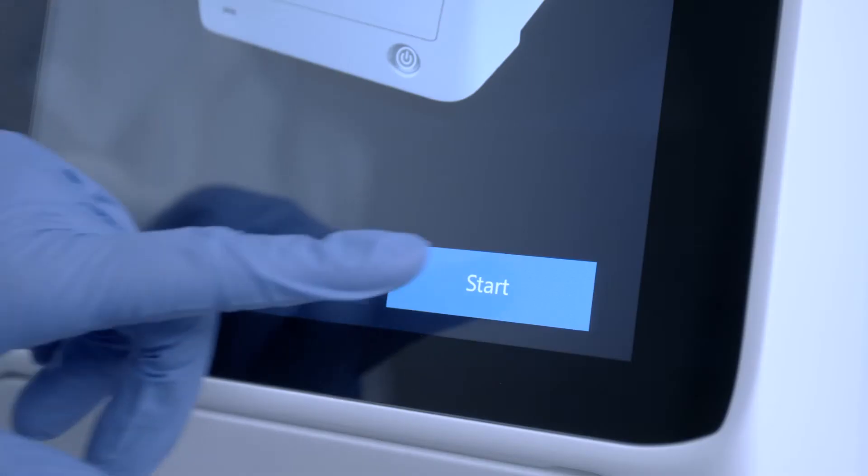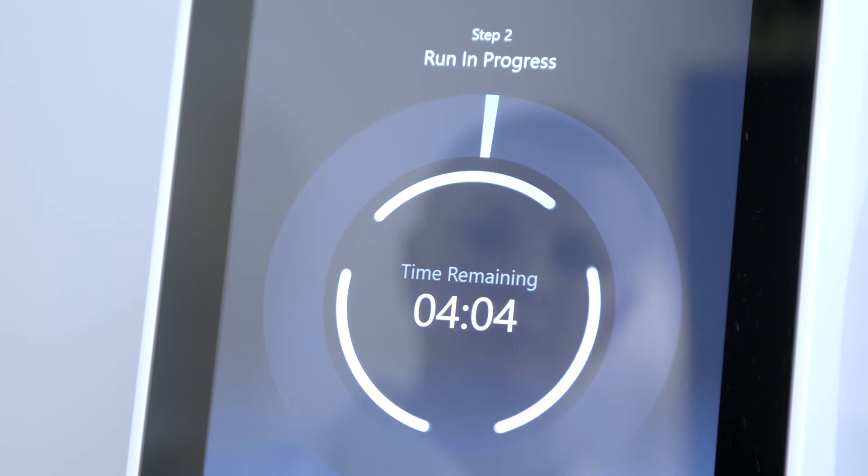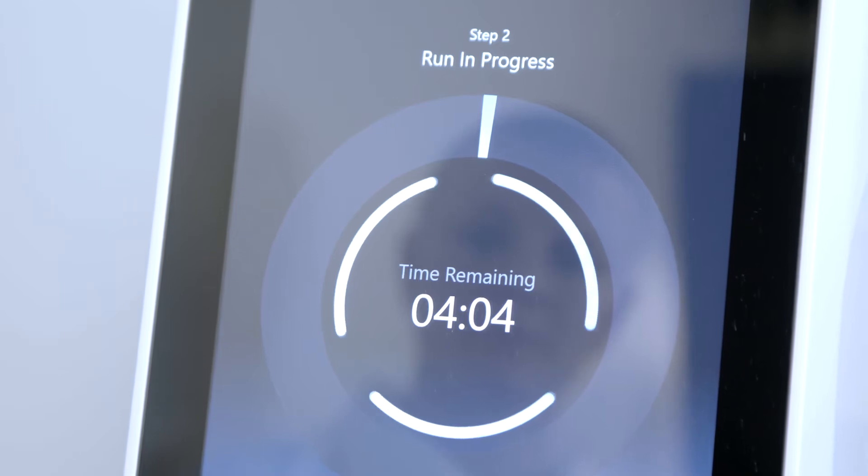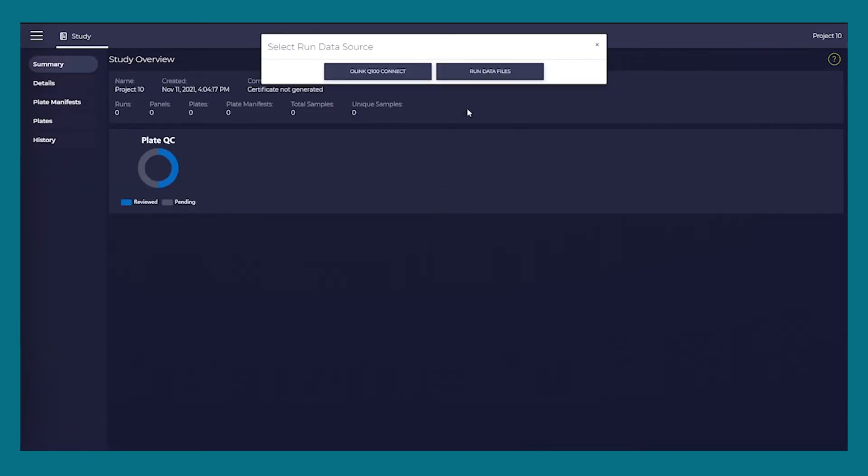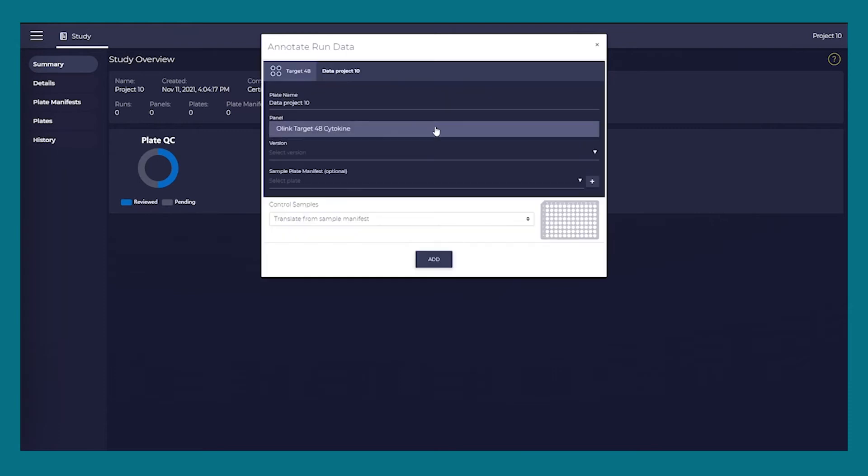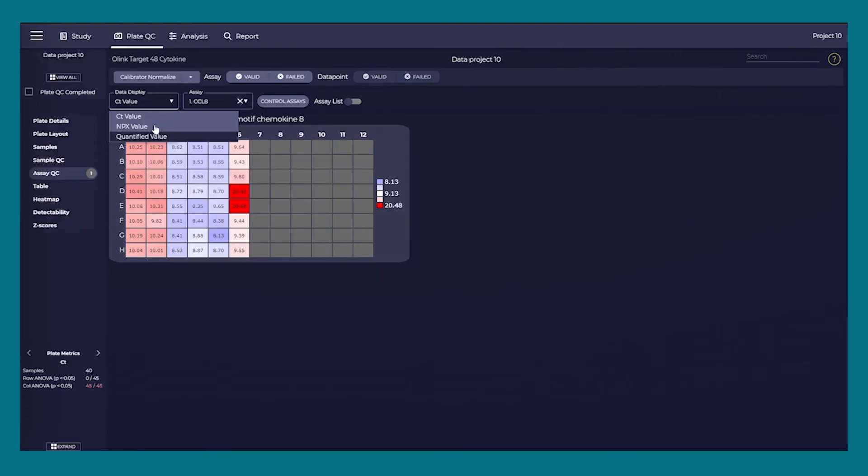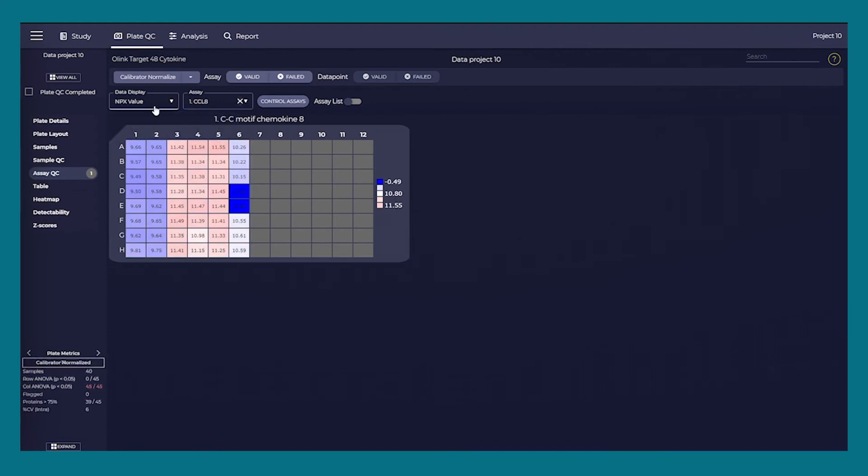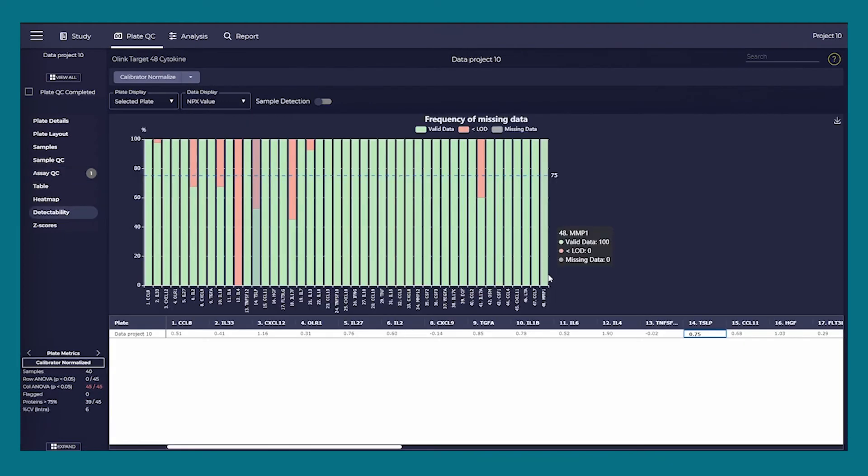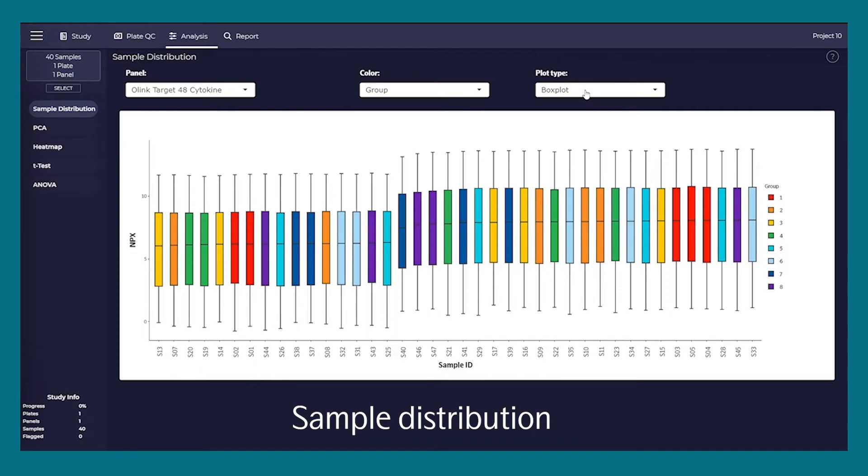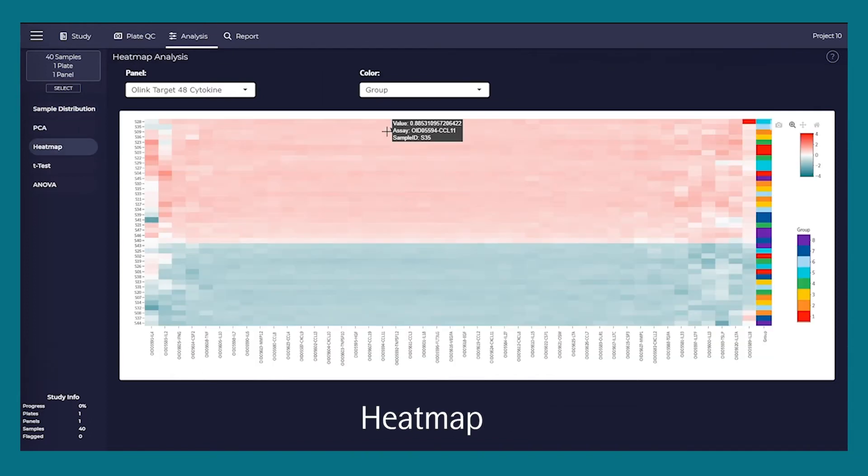At the end of the run, easily export and analyze your data using NPX Signature, an intuitive software specifically designed for the handling of Signature instrument data. Convert qPCR data into protein values, conduct data QC, and perform simple statistical analyses using just one software program.